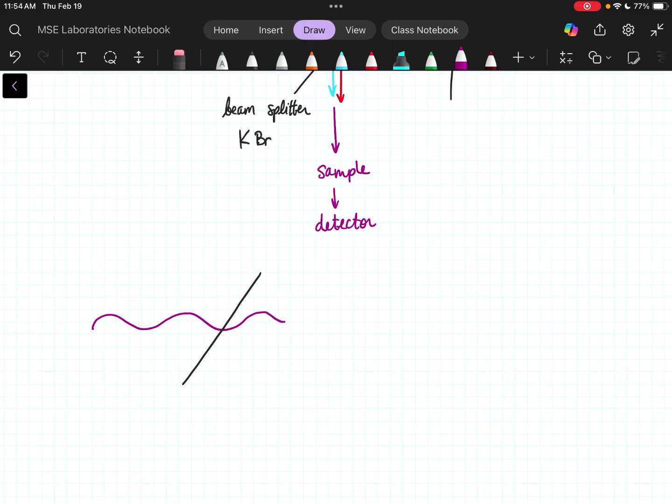Meaning, as it passes through, we're not going to have the wavelength, the pattern, affected. And this reflection, do you see how this one is starting at its low point here? The reflection is also going to start at its low point. So we started at the low point here. Does that make sense?